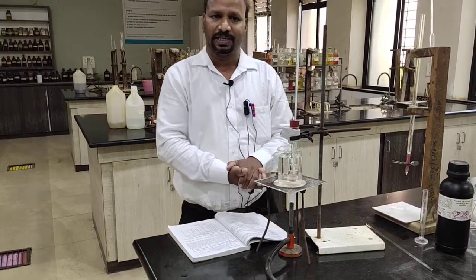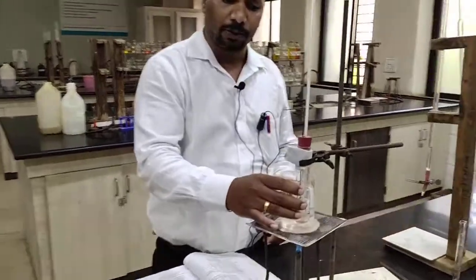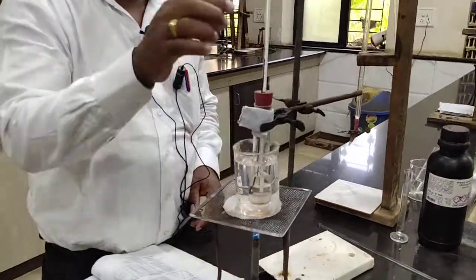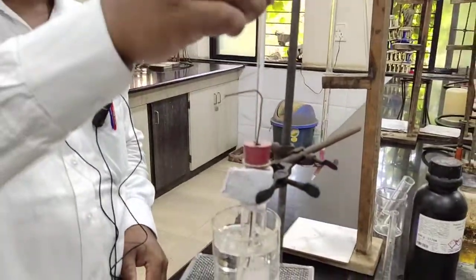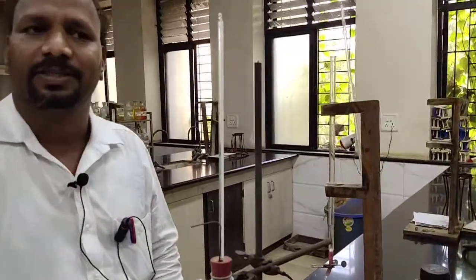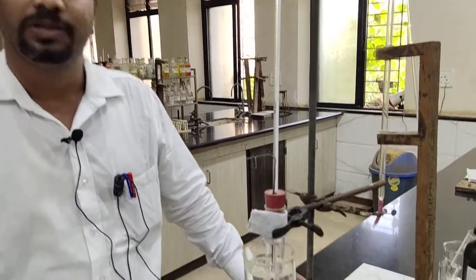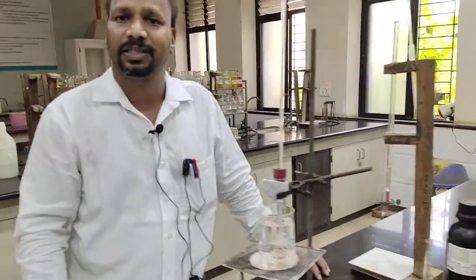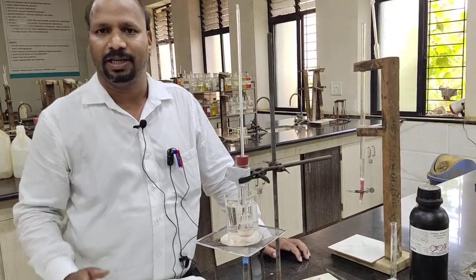Now for the experimental setup, it requires a water bath, or you can use a sand bath also. Mostly we are going to use a water bath here. It requires a hard glass tube, a rubber cork, a stirrer attached to this cork, and a 1/10 thermometer. A 1/10 thermometer means the temperature is measured with 1/10 accuracy. That means for 1 degree we take 10 parts, so we can measure up to 0.1, 0.2, 0.3 like that.